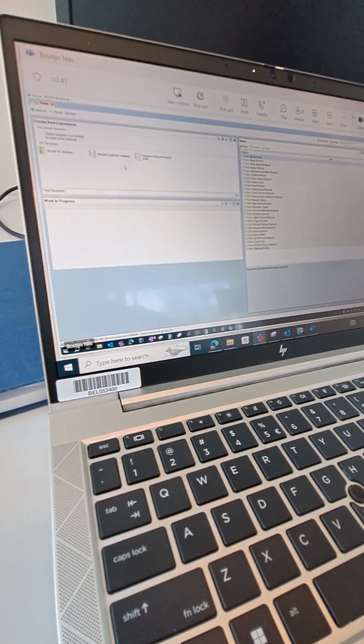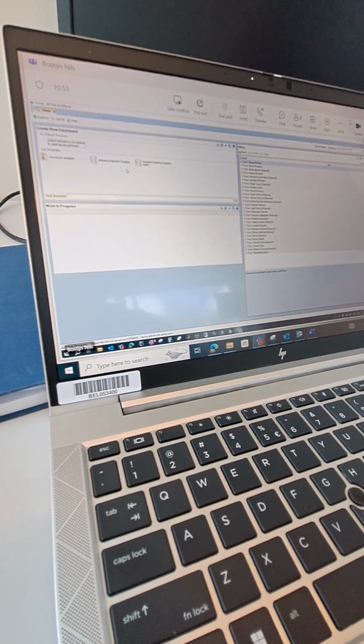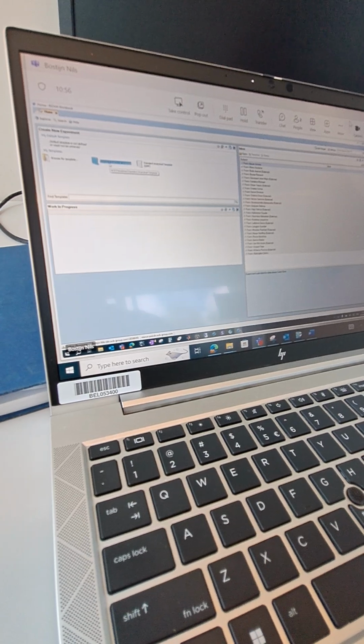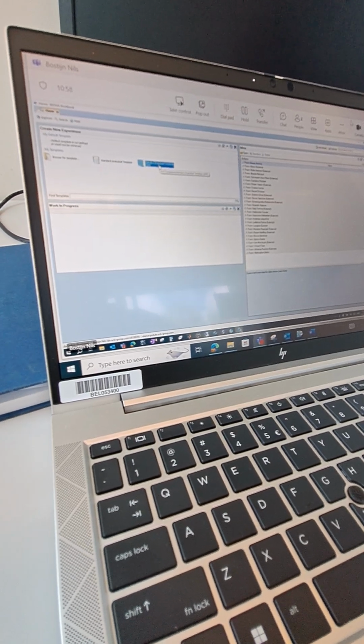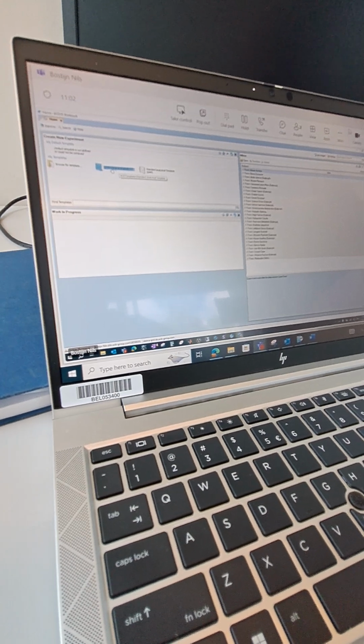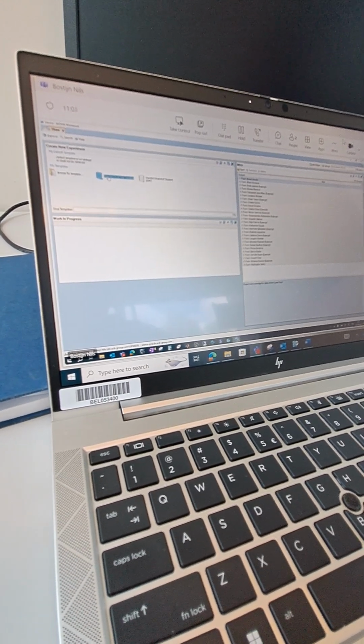Basically here we can create a new experiment, a new ELN. You see here that we have two versions. It's a standard analytical template and the same one but GMP. You of course only need to use this one because everything you will do is non-GMP.